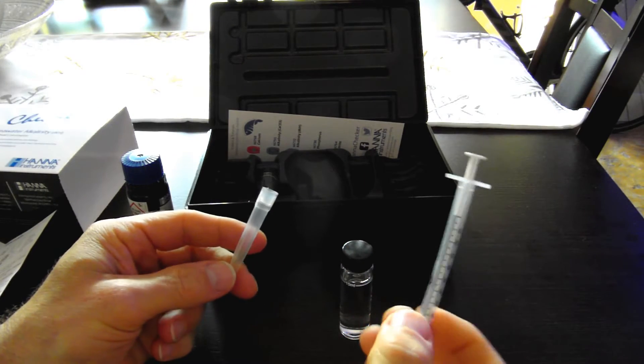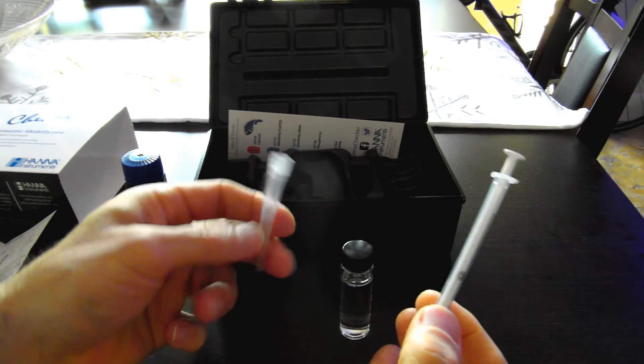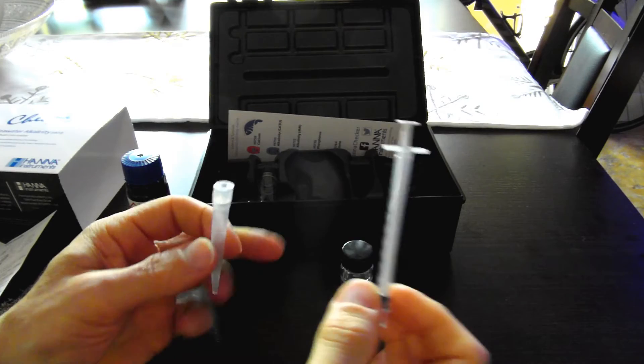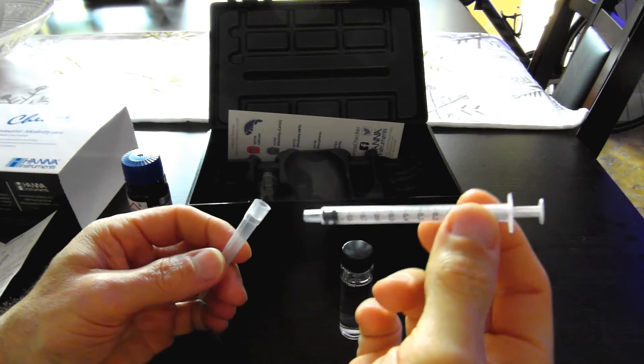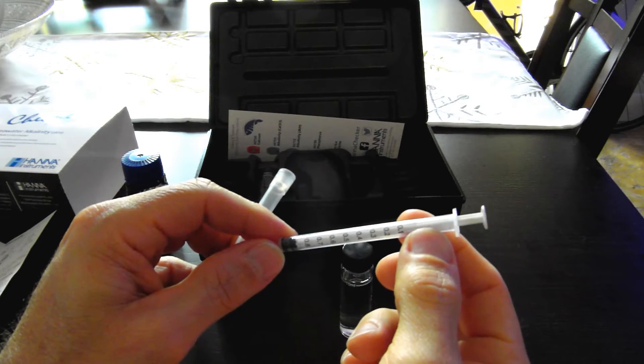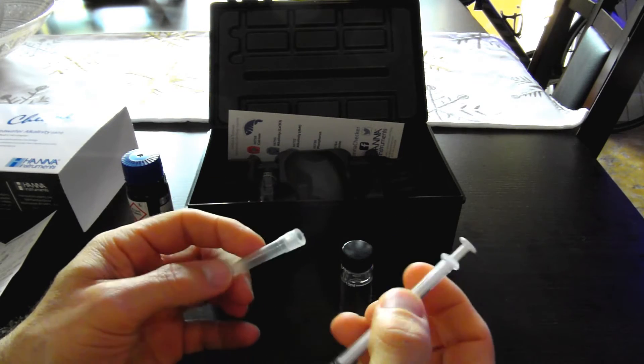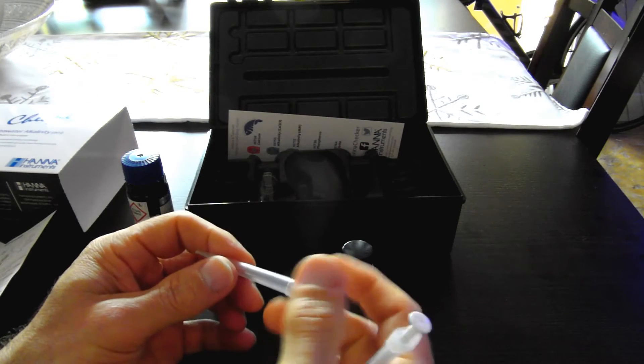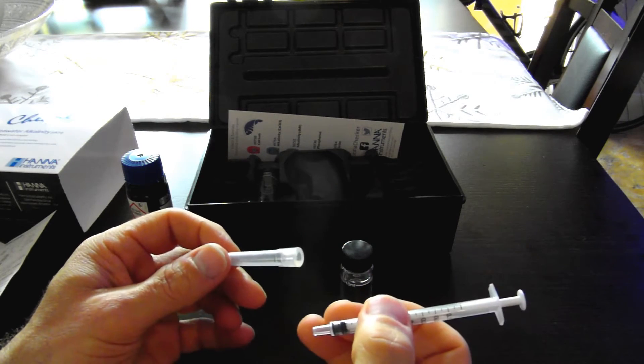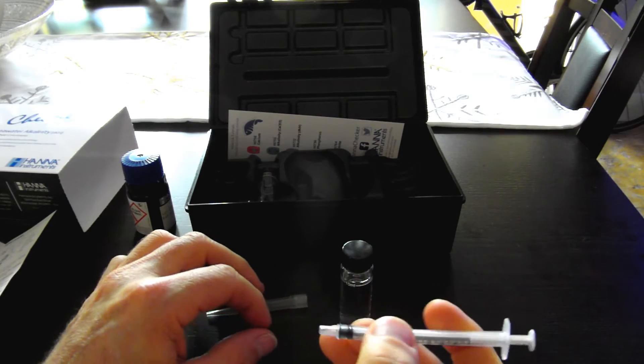All right, with this Hanna Checker you get a 1 milliliter syringe and also the tip. Doing my research online, it looks like some folks prefer to use the syringe without the tip and bring the reagent up all the way to the 1 milliliter level. The jury's out. Some folks use the tip, some don't. Some don't like the extra space or air introduced when the tip is used. I'm going to go without using the tip.